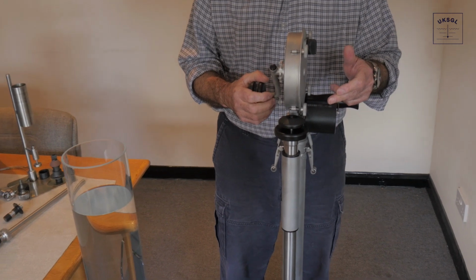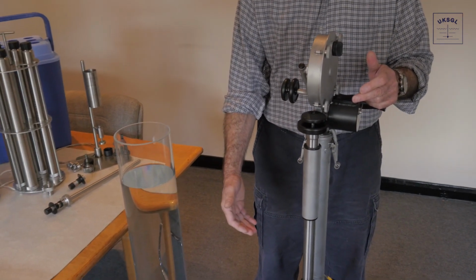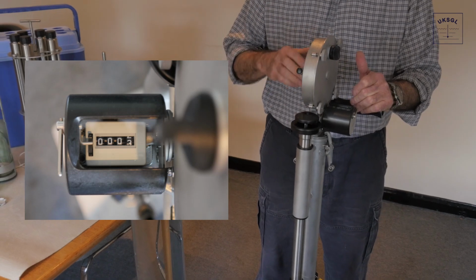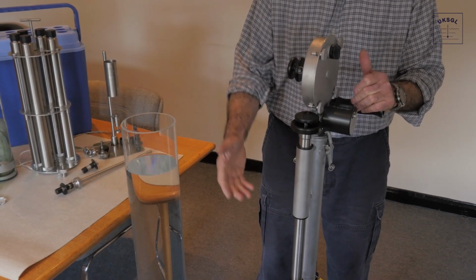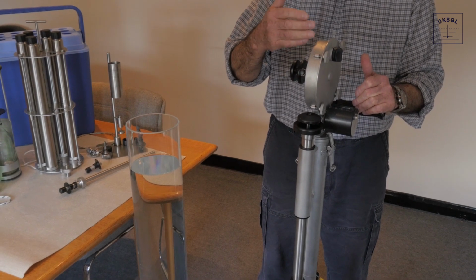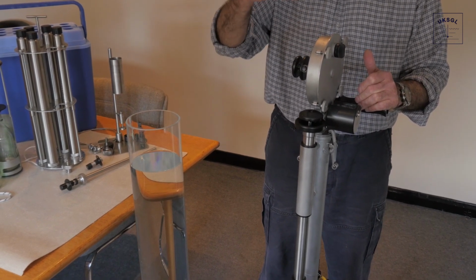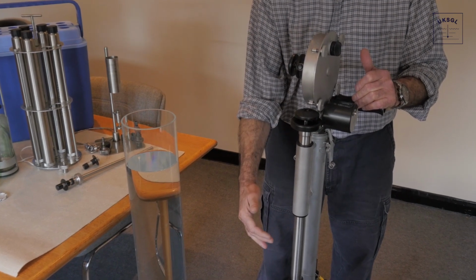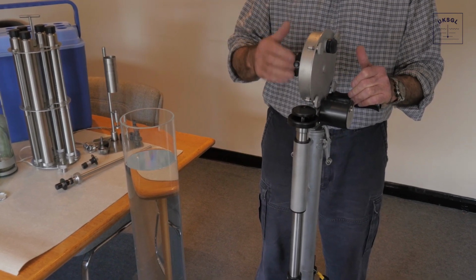The tube is then lowered at a steady rate whilst using the counter to monitor the depth of the tube. Owing to the design of the all-level probe, the tube only fills during descent into the liquid. To bring the tube back up, there is no restriction on how quickly it can be wound back in.